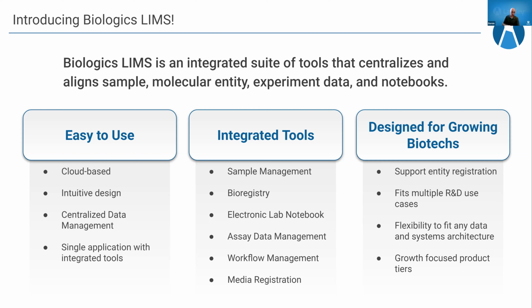Driving agreement across your organization for data structural expectations and then enforcing those expectations really levels those hurdles to collaboration and progress. As an added advantage, it will help deepen your systematic thinking about data and collaborations, as well as one scientist or one team of scientists' understanding of how other teams work, what they expect, what they need from you, or what you need from them.